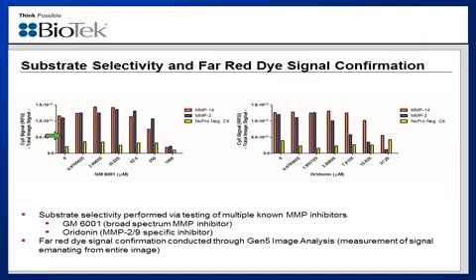However, the dose-dependent decrease with the addition of oridonin is only seen in the results from the MMP2 substrate shown in blue, and then again, there's really no appreciable change shown with the bars in red from the MMP14 substrate. And this again confirms that accurate results can be achieved when combining the EnSens assay components with the 3D tumor invasion procedure.